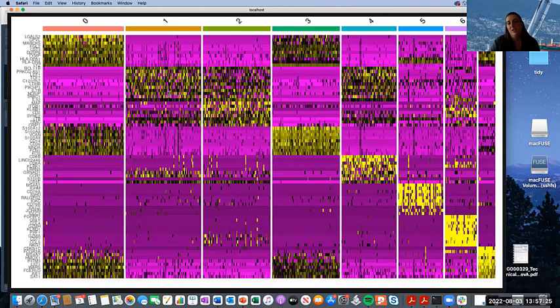So when you do this, I do believe you will have a pretty clear-cut light-up section of yellow for 0, then 1, then 2. It should be very clear and obvious in your data what markers go with what cluster. And then you can look at what those genes mean. If you don't know, which I'm Googling things all the time with these genes, you can look at these genes and see, okay, of these genes, what cell type do I think this is? So looking at this, I see a lot of HLAs, I see LYZ. I'm thinking this is either macrophages or monocytes at this point.